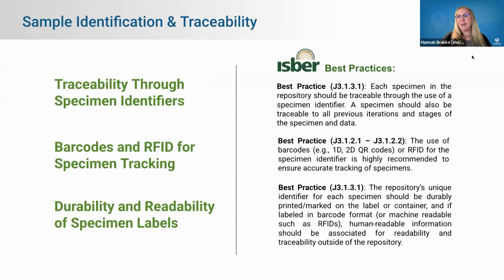So let's jump into these ISBER best practices. What we've done today is gone in and looked at the best practices that align with what software can help with. So these are not the full list of best practices. It's really a curated list of the things that software can help biobanks do.